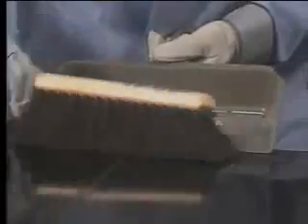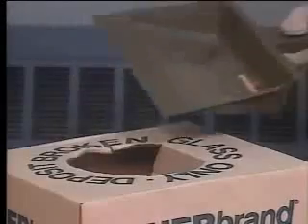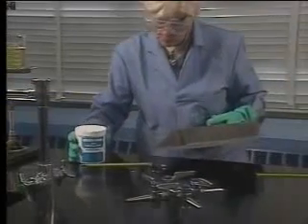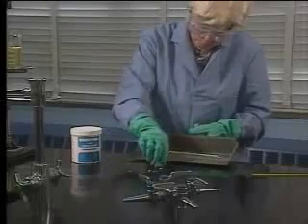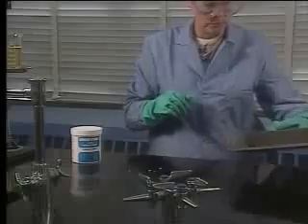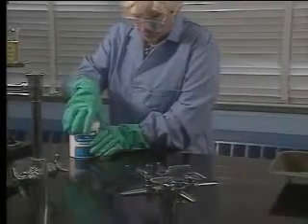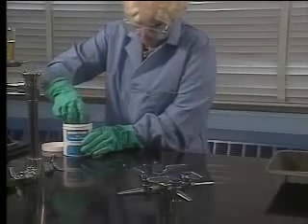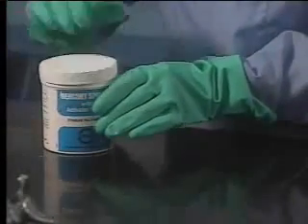Glass fragments can be swept up. If any alcohol happens to escape from the glass, it can be wiped up with a paper towel. Cleaning up a broken mercury thermometer is more difficult and also a job for your teacher. Mercury is poisonous, and it won't soak into a paper towel. Mercury vapors also can escape into the air. If you work with mercury thermometers, your lab may be equipped with a mercury cleanup kit or sponge. The kit and broken glass should be disposed of in the proper container.